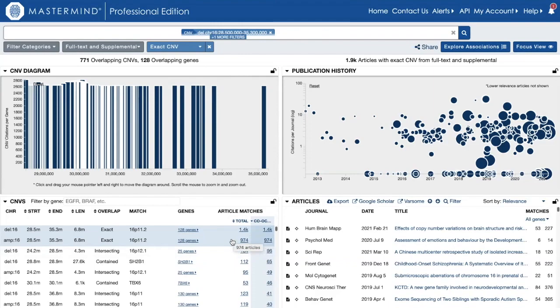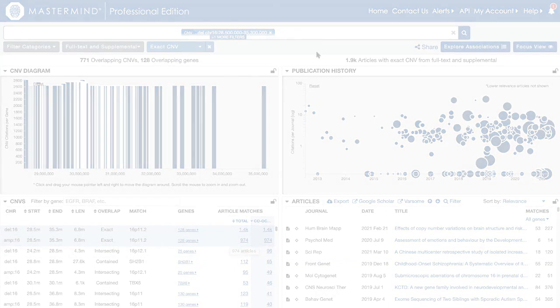I can further refine this search by adding phenotypes and other filters if I want to refine the output. Okay, thank you.